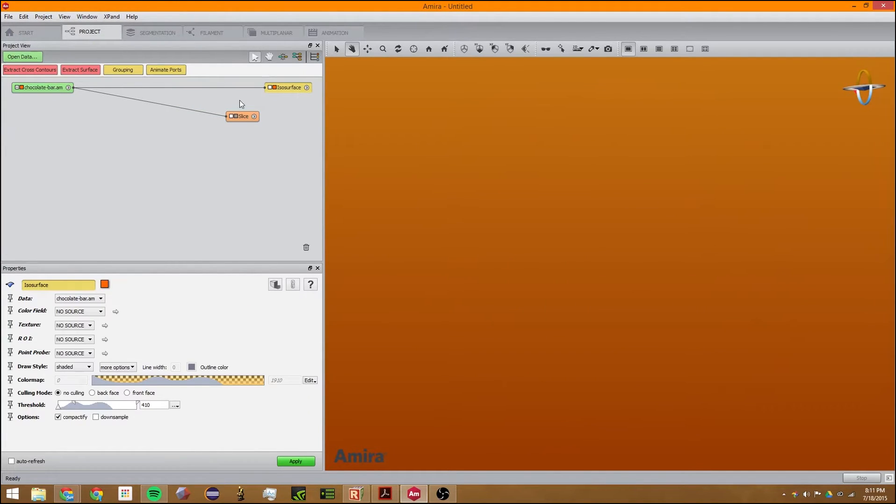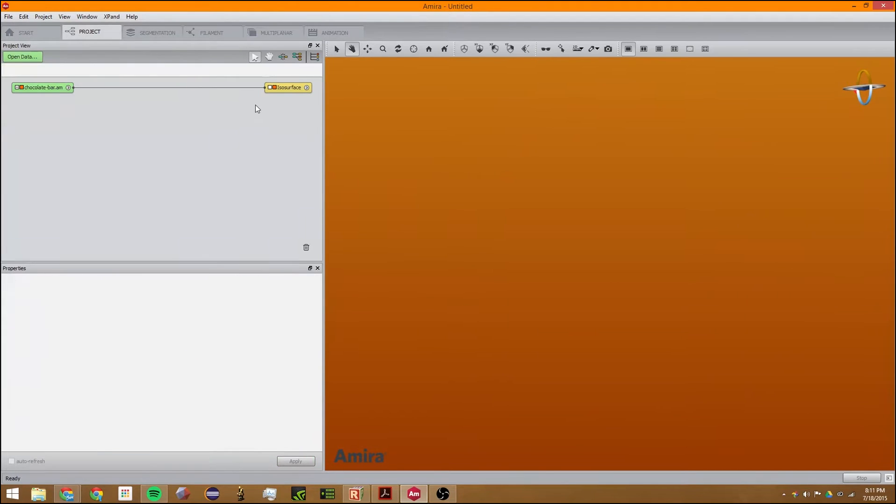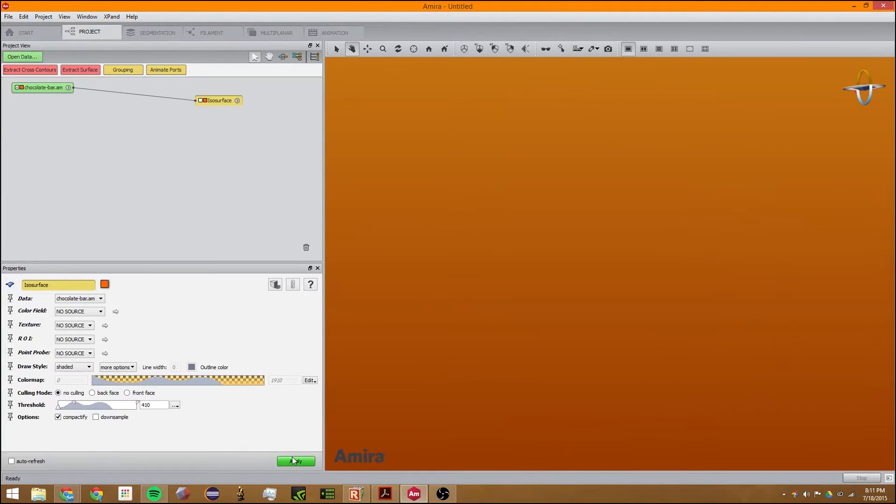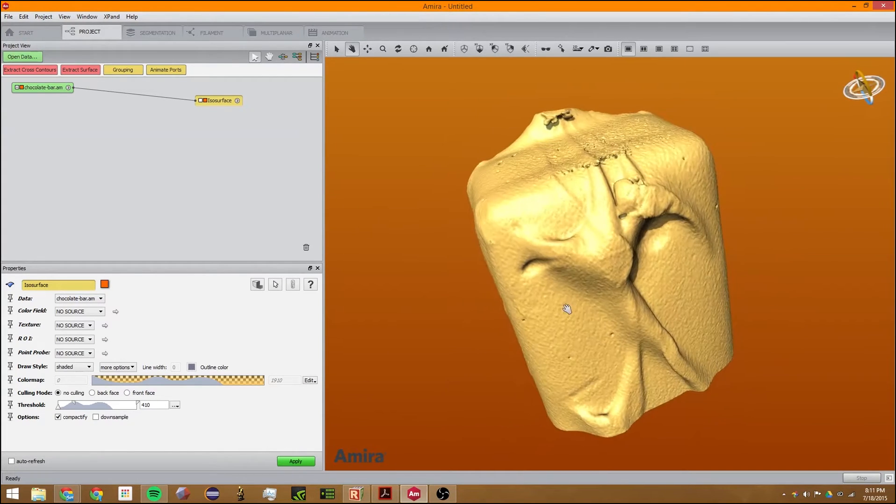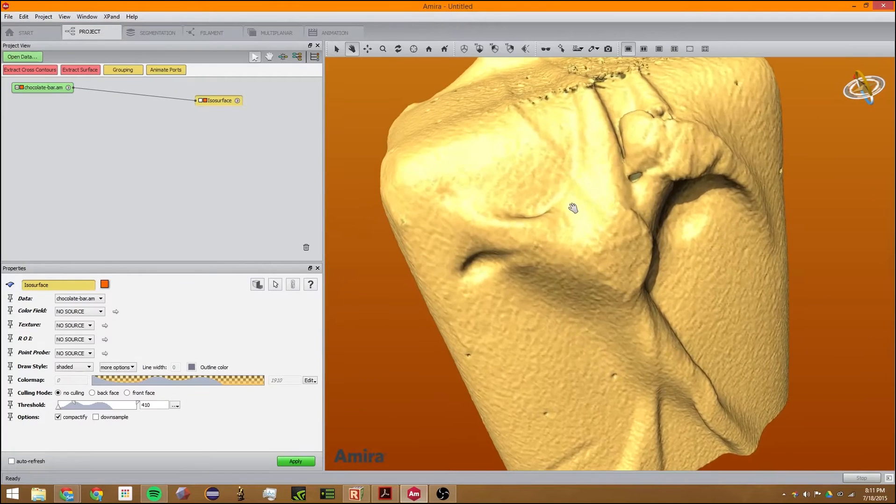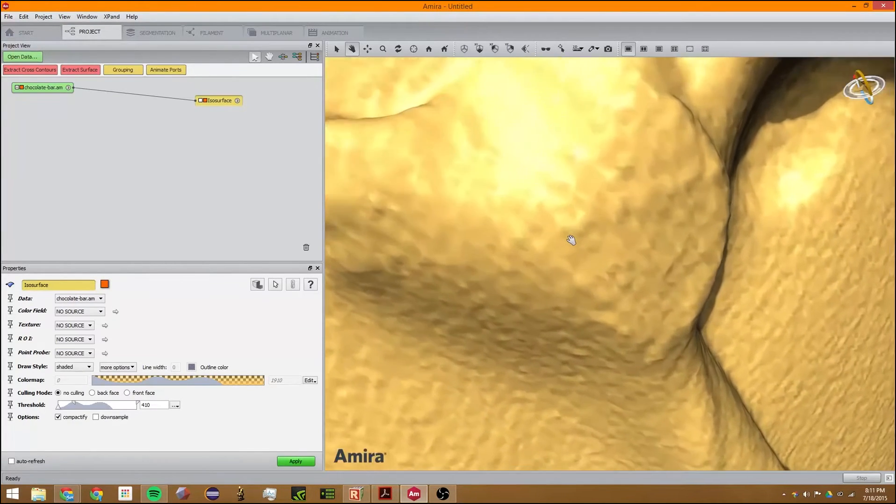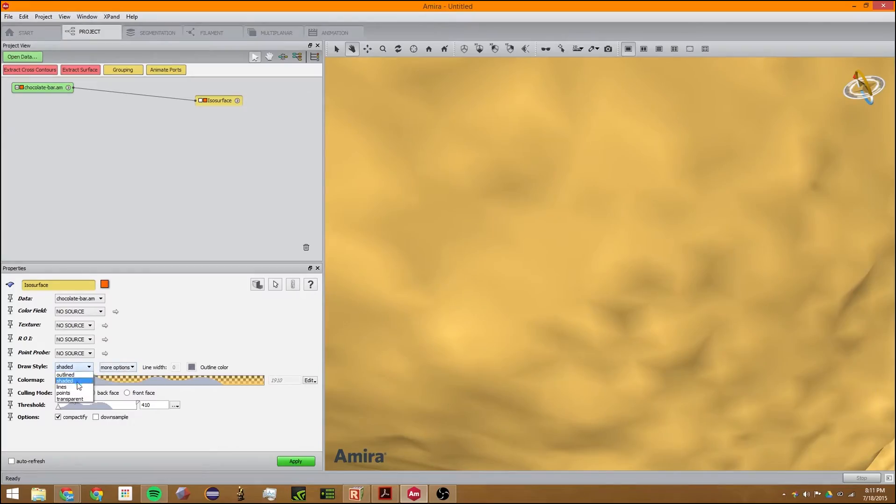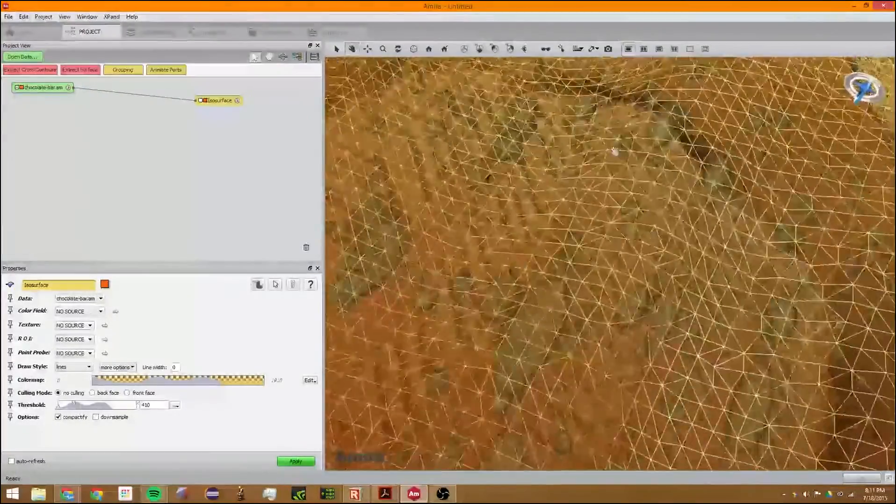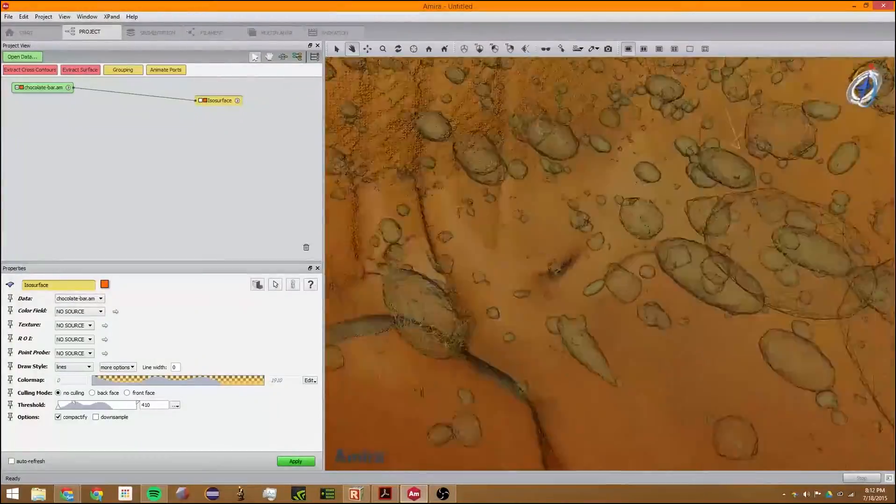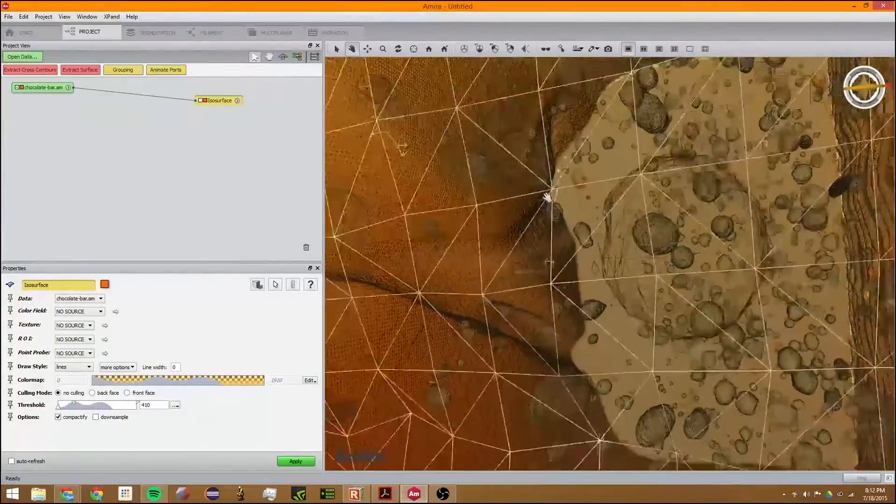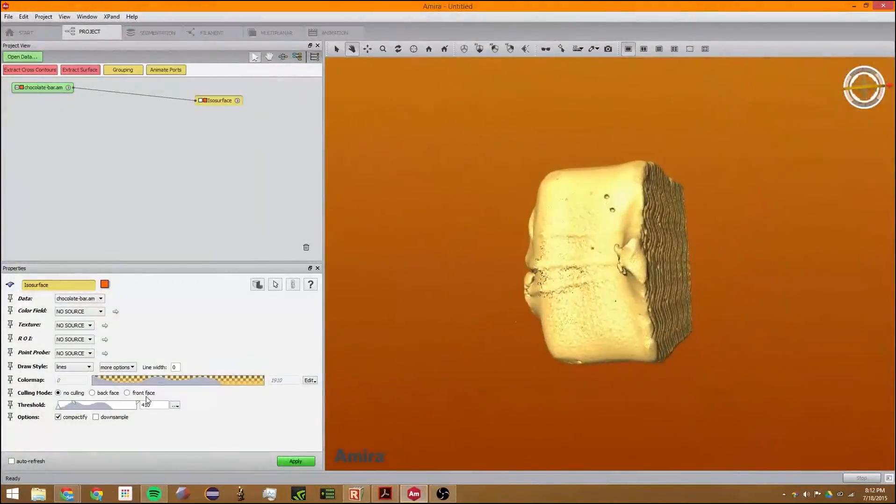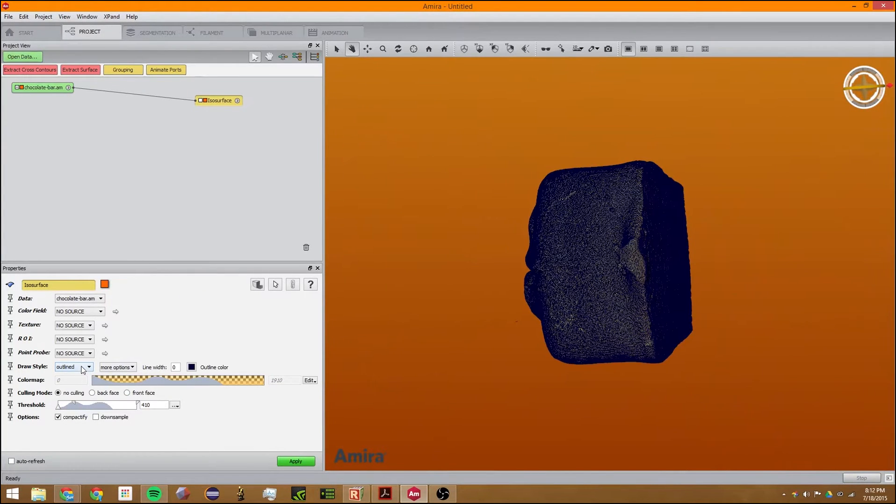If you're familiar with 3D modeling, we use a lot of STL files. An isosurface is like making an STL file out of this. It's a bunch of triangles, a triangular mesh. This is the inside of it.